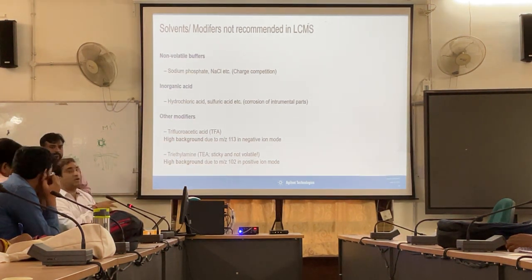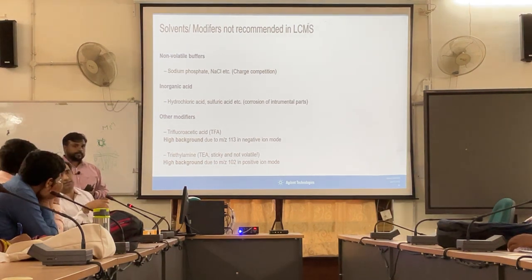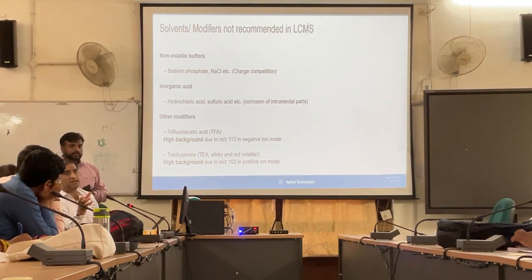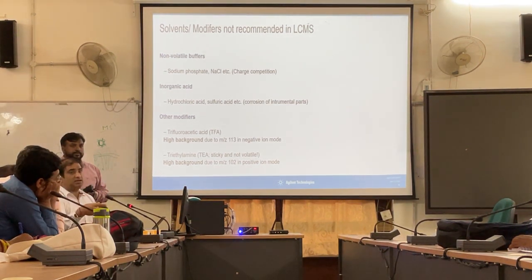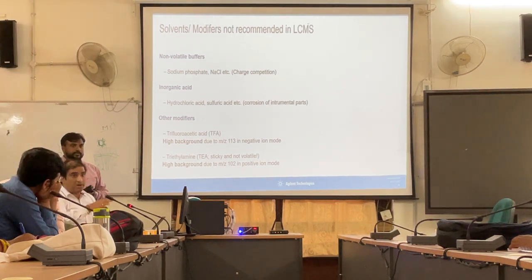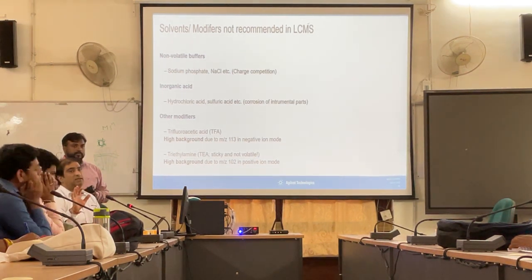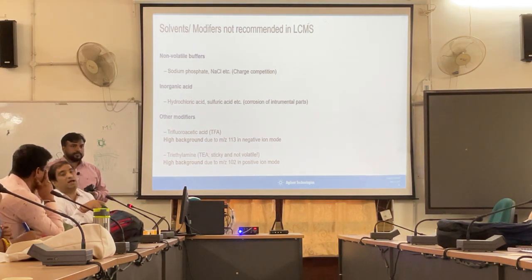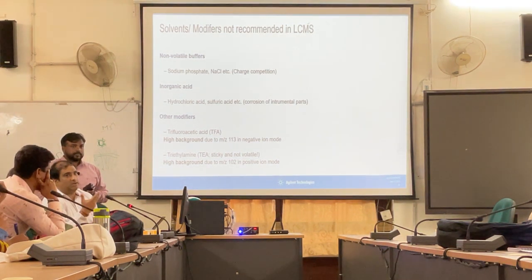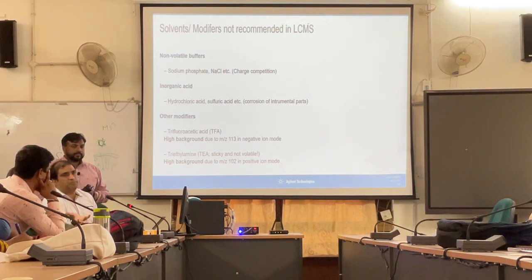If it is a modifier, what Amod is saying is that sometimes, to make the peak shapes better and make the chromatography look nice and separate the molecules, people add triethylamine in the mobile phase. And the mobile phase keeps on coming continuously. That is the reason we need to avoid triethylamine, because it will interfere with the ionization. Otherwise, whatever is present in the sample will all come. Everything will come in the sample.